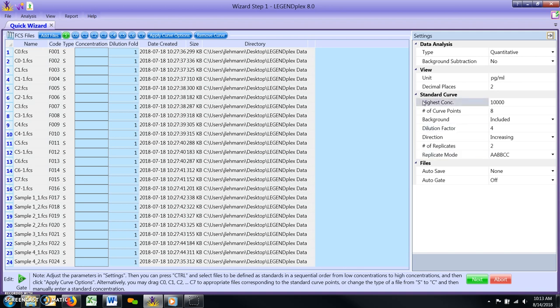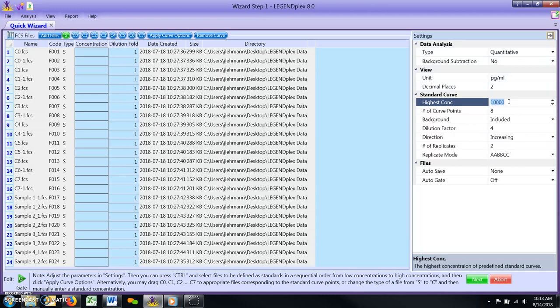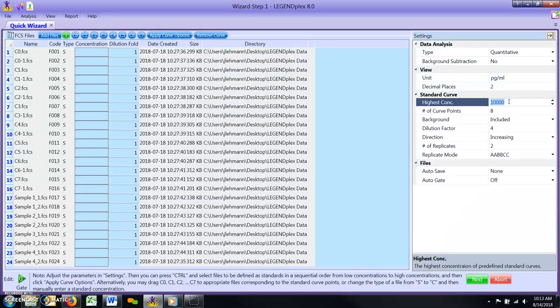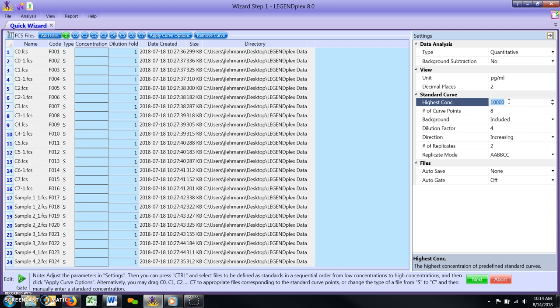Important setting options include the following. Highest concentration. By default, this value is set to 10,000 picograms per milliliter. Certain LegendPlex assays may contain alternative standard concentrations. Please consult the certificate of analysis included in your assay to determine the specific values for your assay. If your panel has top standard concentrations over the 10,000 picogram per milliliter, these values will be adjusted later in the analysis. Do not attempt to adjust the values here.